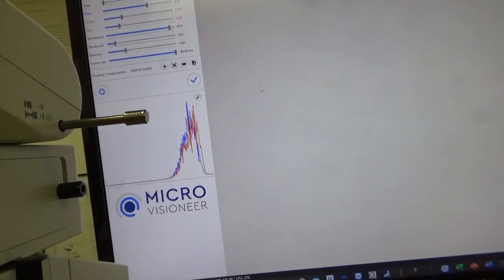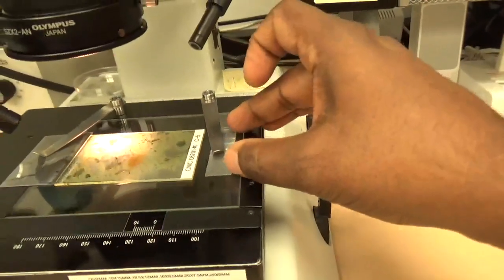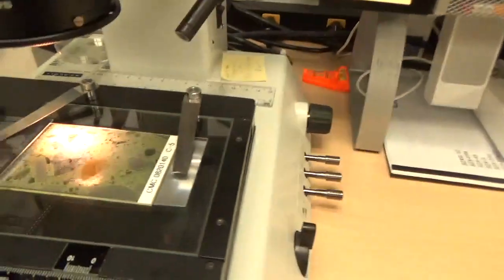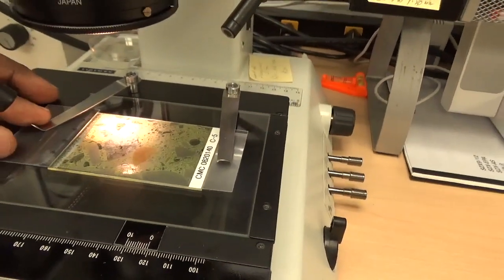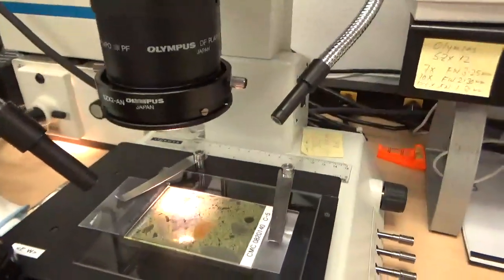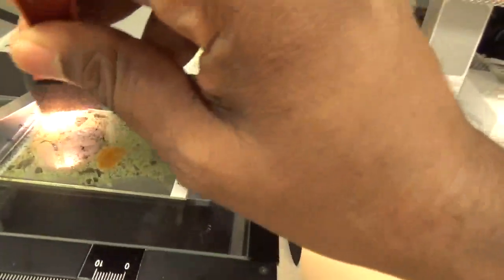Then you put your sample. Put your transparent flexible scale bar at one side, then another plastic sheet on the other side so the sample doesn't move. And then I go to one edge of the sample so I can see the scale bar, and that's kind of the border of the sample and the scale bar. I see some hair or fiber there. Airborne fibers are everywhere.